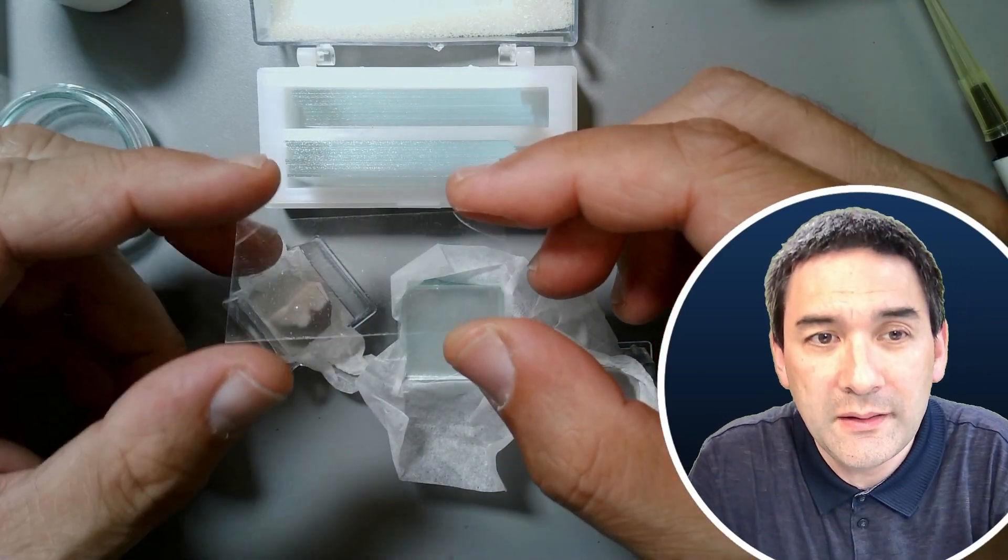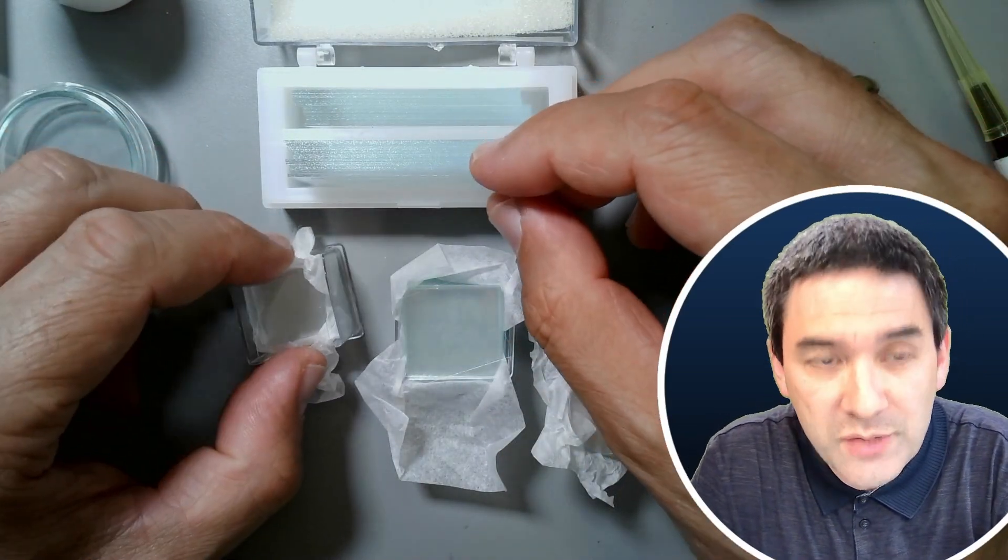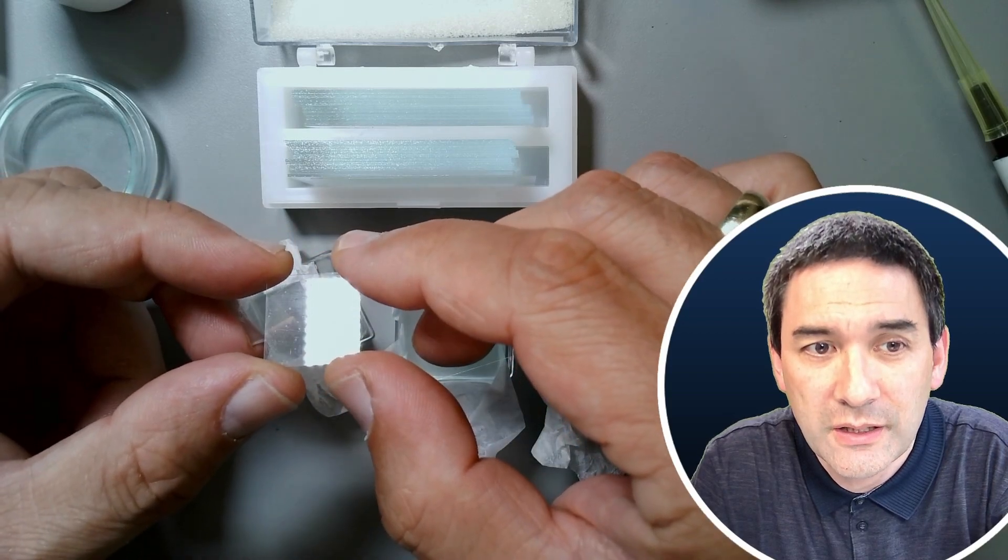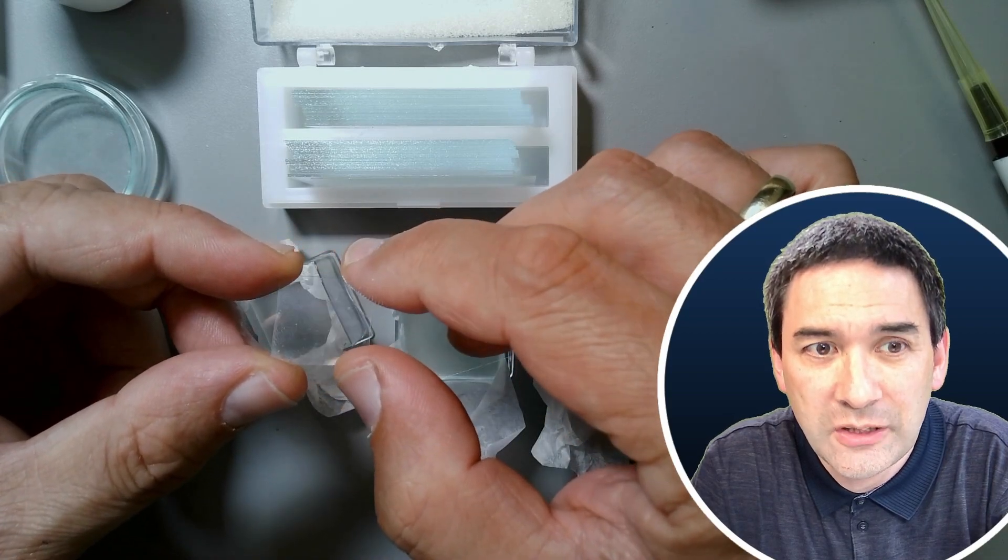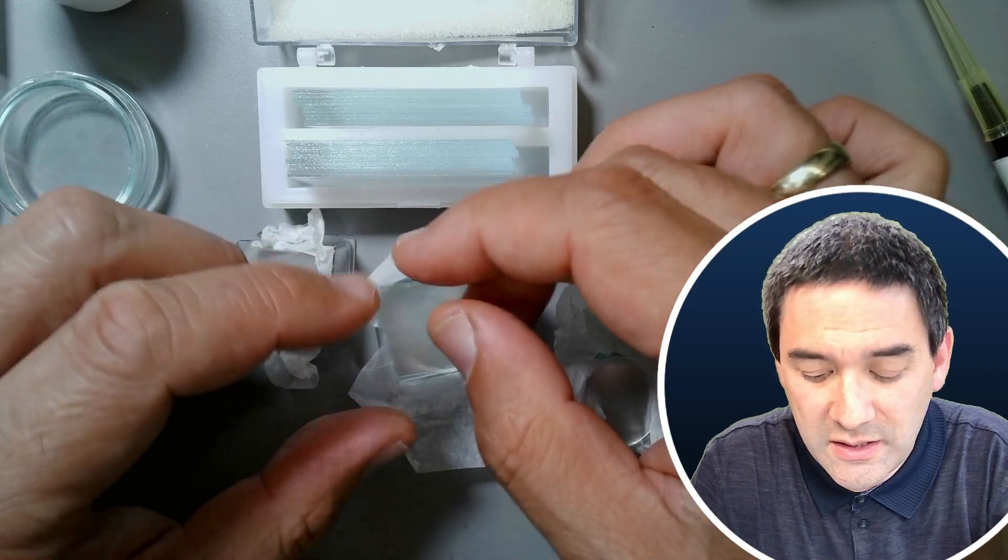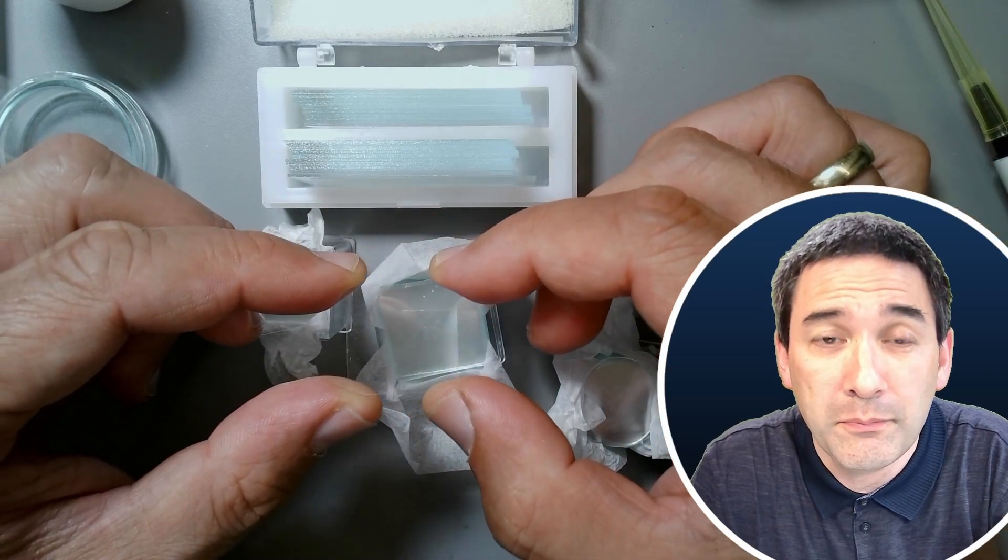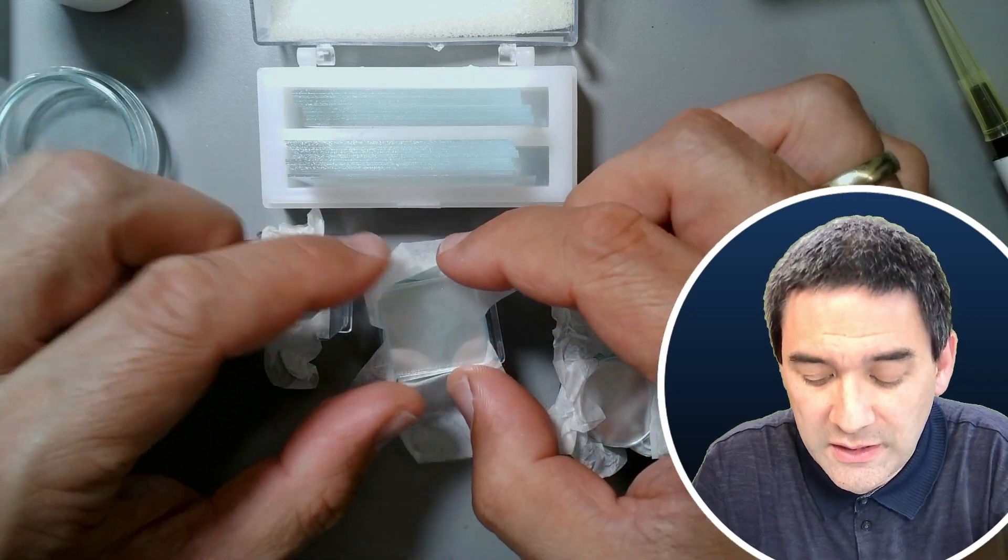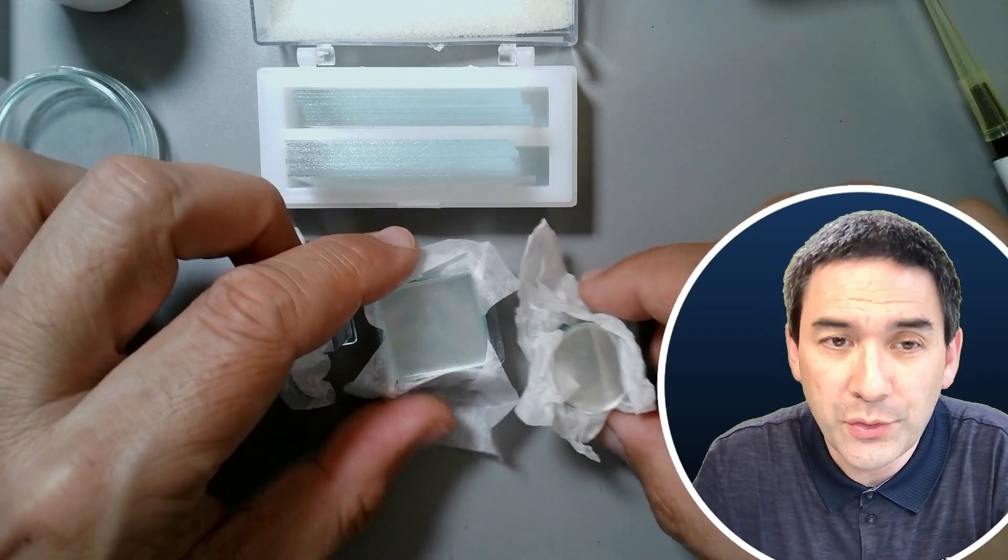This one has a side length of 18 millimeters. This one has 22 millimeters. It depends very much on the size of your specimen that you want to use. Otherwise it doesn't make a huge difference.